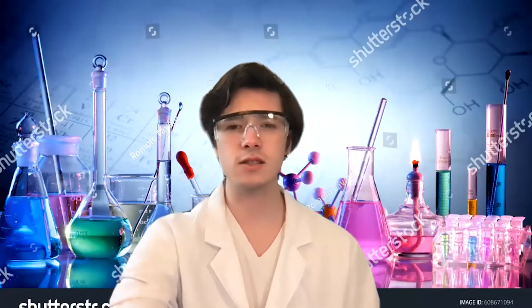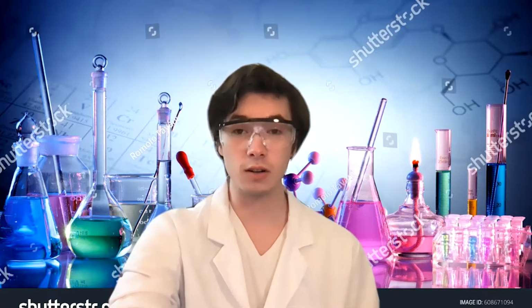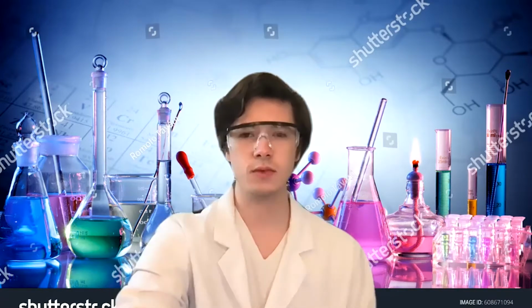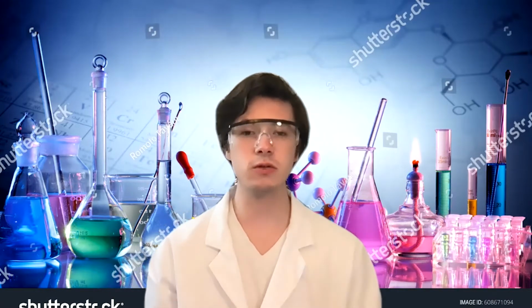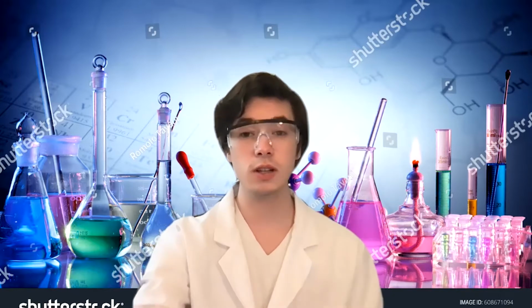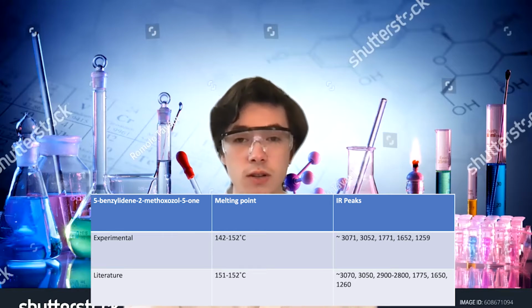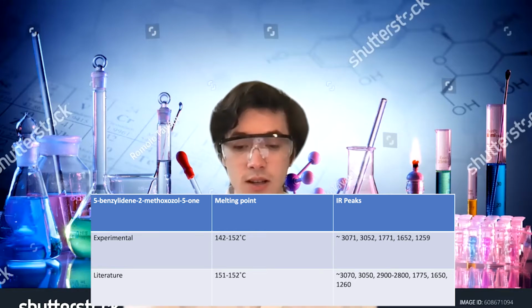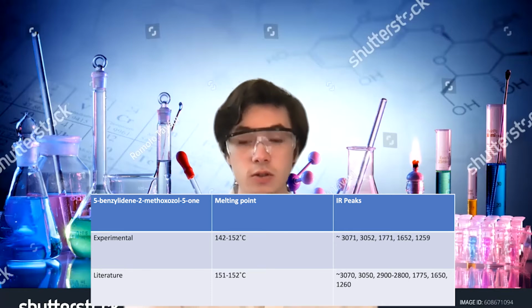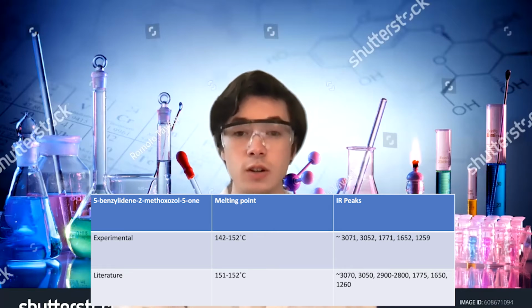Let's check out the tests that were done to assess the purity and the composition of the product that we got from this synthesis. Looking at the melting point, I would roughly say that's around 142 to 152. Looking up the literature melting point of our product, SciFinder gives a melting point of 151 to 152, but the difference is probably due to some contamination in our final product.